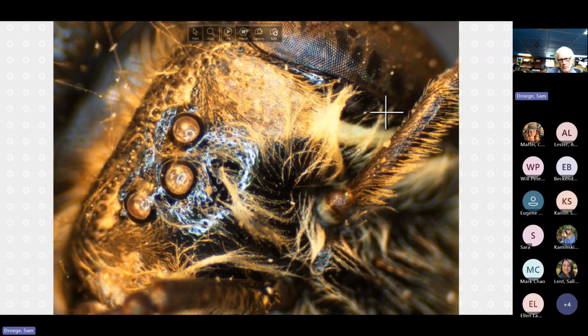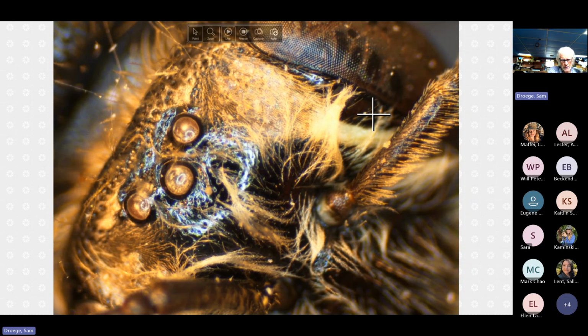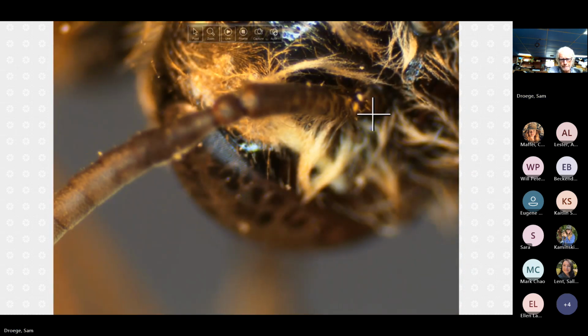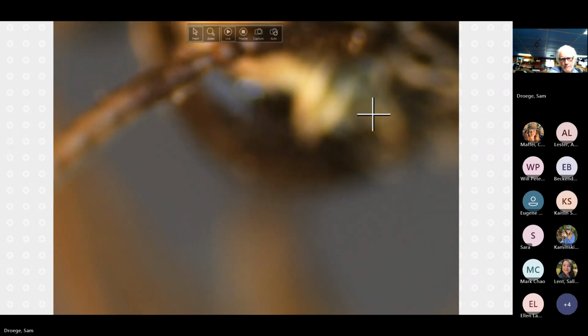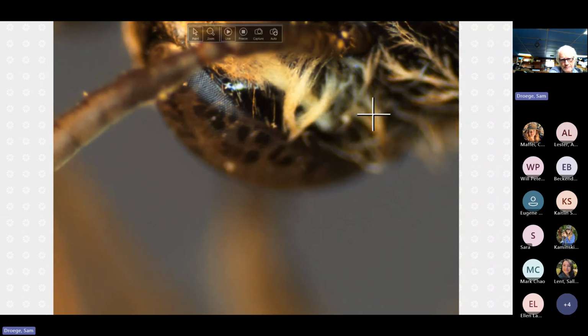And here's this bow. Okay, so here's this distance, and we're looking at this scape as a measurement. We have a parallax problem here with the microscope to really use that, but we're using the apex of the first segment of the antenna to measure this distance, but this is bowed away and quite a distance. Let's see if we can see that better on the other side. We can see that pretty well.